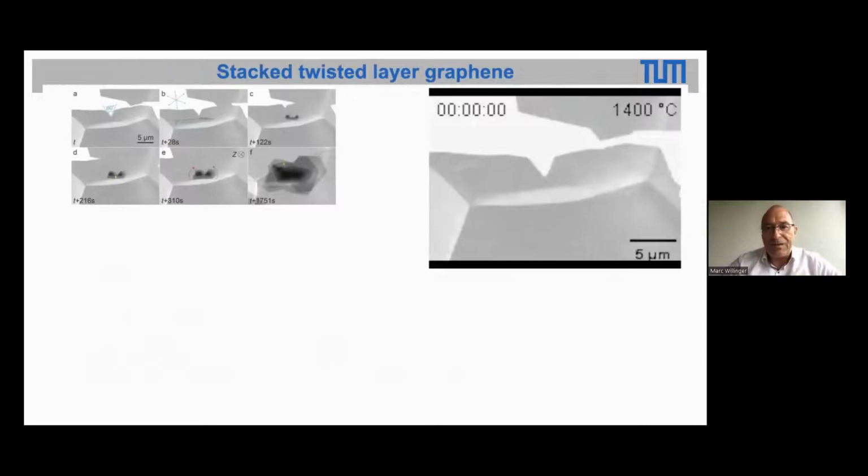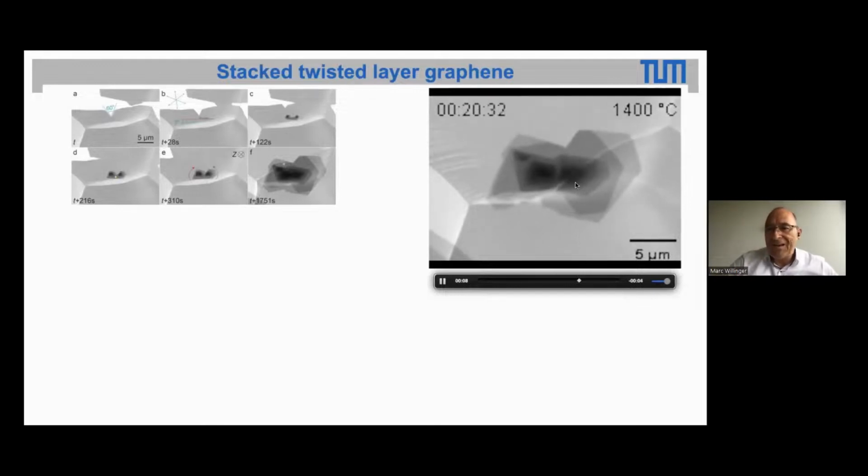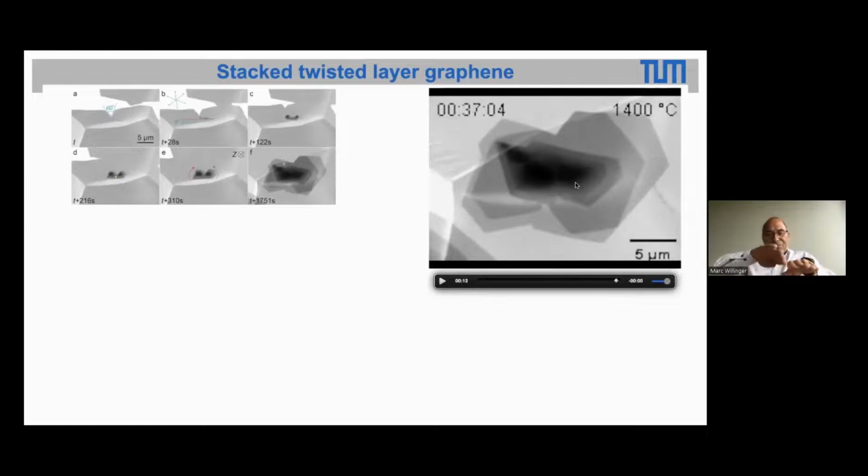On a large scale, this is a video that shows the real world happening of such a graphene spiral. Here is a single wrinkle with the front, and at the top end, we get this spiral graphene growth. And as I mentioned before, it is possible to control the wrinkle orientation on the graphene. And by this, we are able to control the twist angle between the layers. And by growing graphene spirals, we can have large area, stacked graphene layers with a defined twist angle.